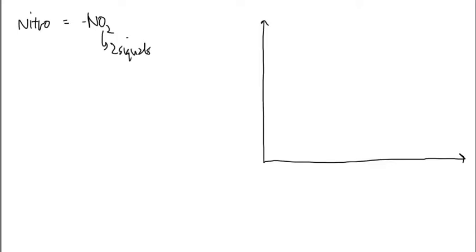The way that I remember these is it's NO2, so therefore it should have two signals. And these two signals are what we would call a symmetrical stretch. And a symmetrical stretch is going to happen in the area of around 1600, and then the other one is going to be around 1400. Give or take a little bit. Again, there's wiggle room that is associated here. But these are symmetrical dips in the infrared spectrum at around 16 and around 14.